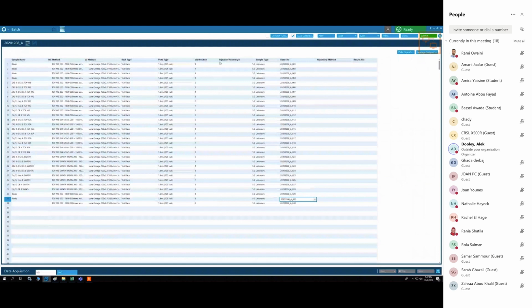Your sample positions, right? File positions. And you have to fill out your method and your LC method, which you have to do anyway in the batch. So that Excel sheet saves you a little bit of time and also keeps things organized and allows you always to have sequential data files in this format based on the date, and then a letter designation, and then a number. So does that make sense for everyone, how to do the batch?